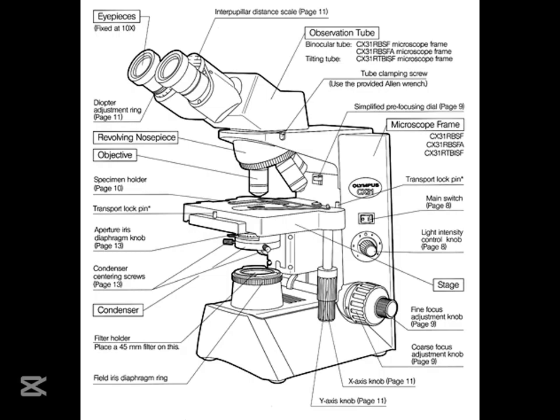So it's like being a detective, searching for clues in a tiny world. Exactly. And just like a detective, be curious. Ask questions. What are you seeing? How does it move? How does it interact with its surroundings? The more questions you ask, the more you'll learn. I love that. Each specimen has a story to tell, and the microscope helps us understand it.